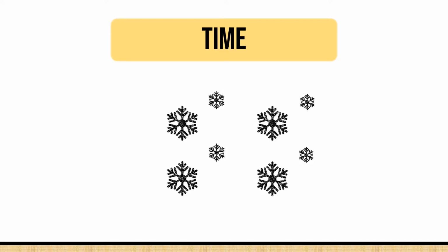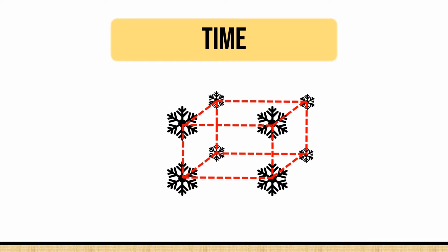The next factor is patience and time. By allowing the solution to cool very slowly, the benzoic acid molecules are allowed to find each other via intermolecular interactions. Time allows the molecules to form a pure solid crystal. This means that the benzoic acid molecules can form the points of the pure crystal lattice. The crystal lattice is the desired geometric shape of a pure crystal, if allowed to form slowly and naturally.